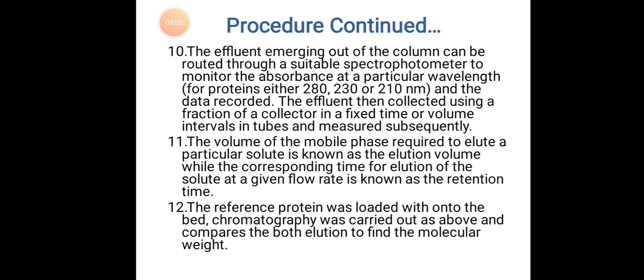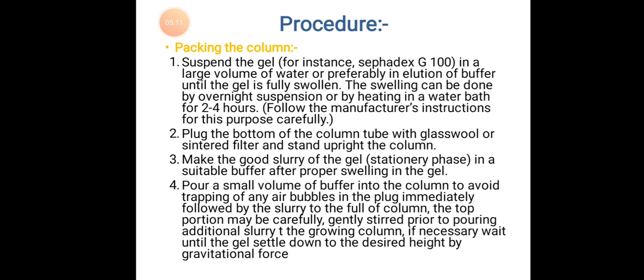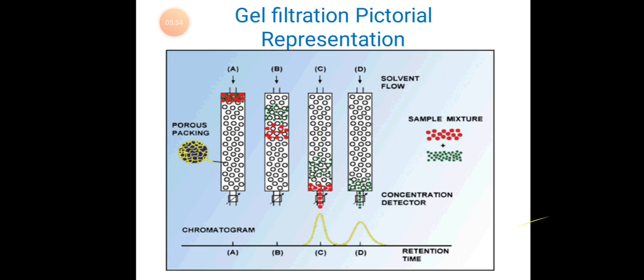The reference protein is loaded onto the bed. Chromatography is carried out as above. Compare both elution volumes to find the molecular weight.